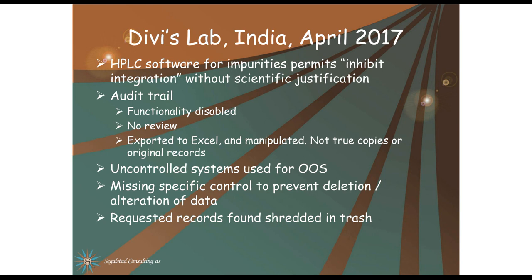Great, thank you so much. Moving on to our next question: we already have a LIMS. How can we check if this has been implemented well enough? What you will need to do is go through my presentation in the back of your head and see if you have actually covered everything that is needed, like all the metadata for the samples, for the analytical methods, and all of that.